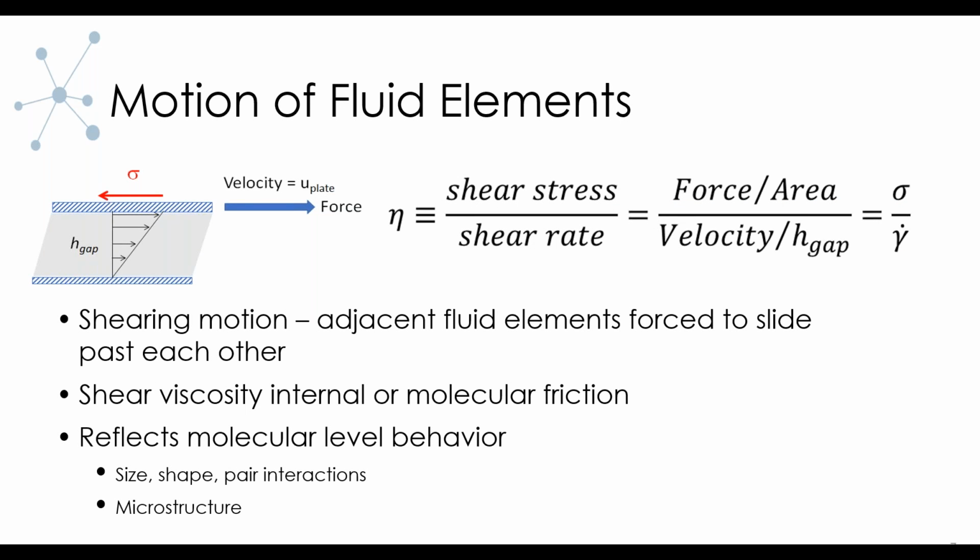Getting into a little bit more about fluid elements in motion, an experiment that is very common in viscosity is the parallel plate experiment, where you have a plate that is stationary and a plate that moves. This is a classic example of how viscosity is measured. As the plate is moved, the fluid resists that movement, and we can take those forces and use them to calculate viscosity.